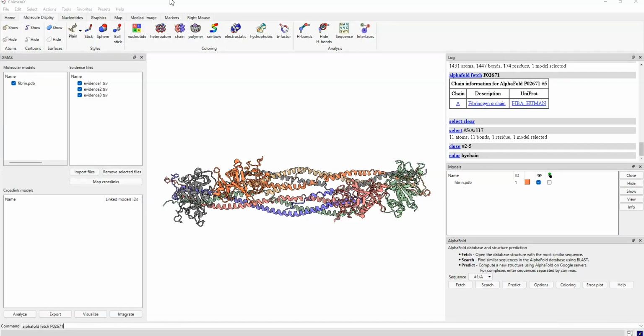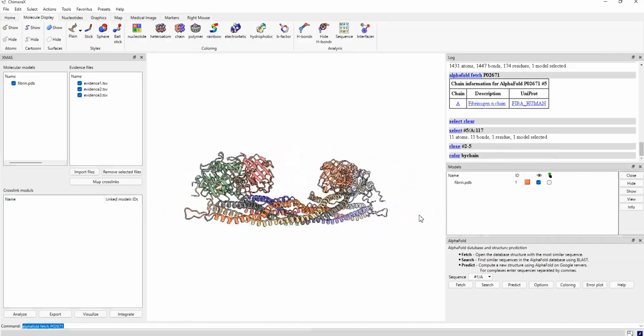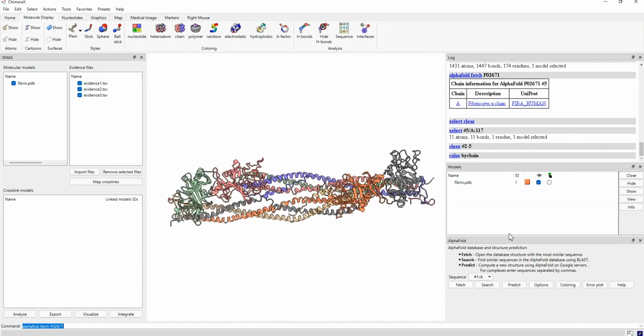Hello again, that's me. I hope you have watched the first introduction to the basics of XMAS. So I will start over where I left, again with the same structure and the same set of evidence files.